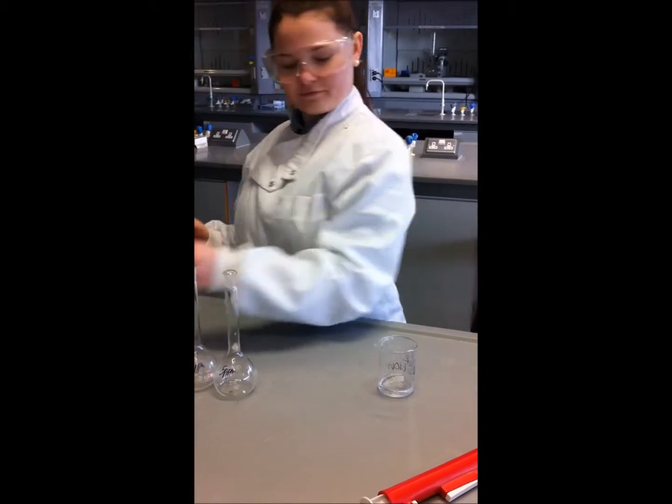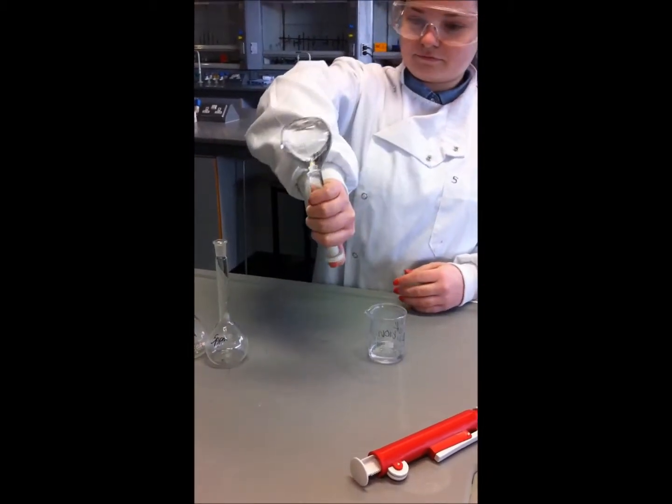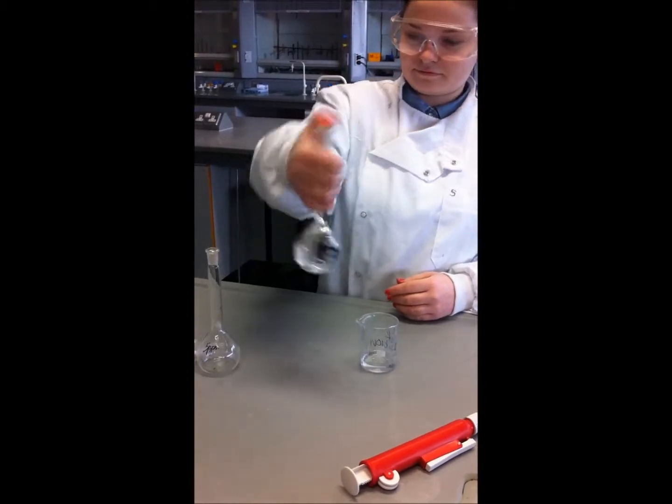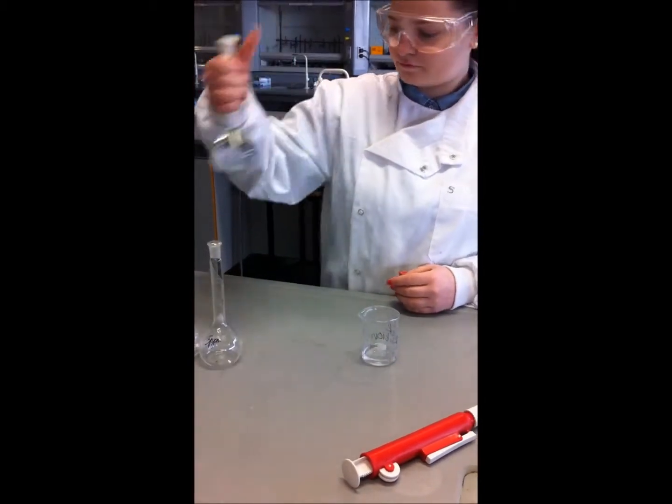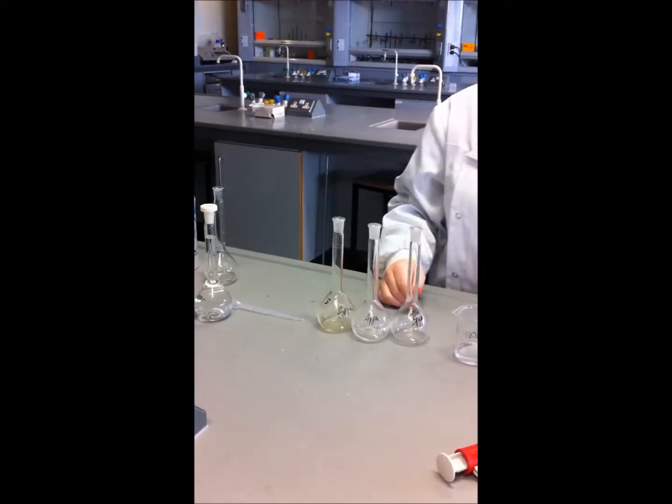Here's one that was prepared earlier. The flask is capped and inverted several times to ensure it is evenly mixed. This procedure is repeated for the remaining volumes of 2, 3, 4 and 5 ppm.